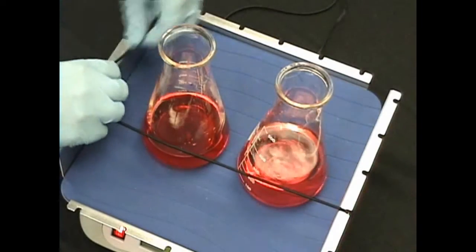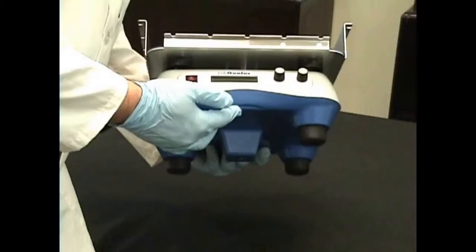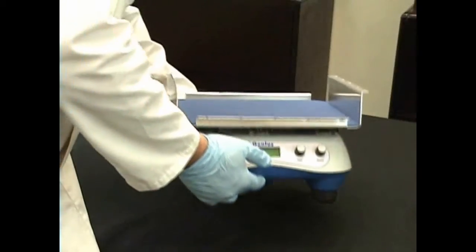Included elastic ties allow users to securely stabilize flasks, beakers, and other vessels. Soft rubber feet are designed to minimize walking.